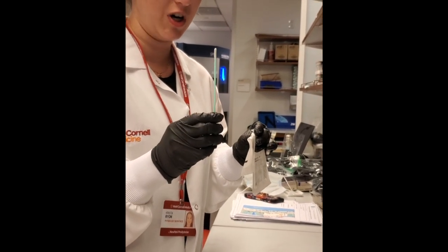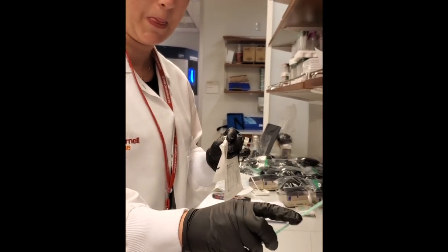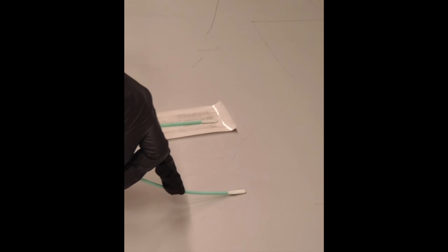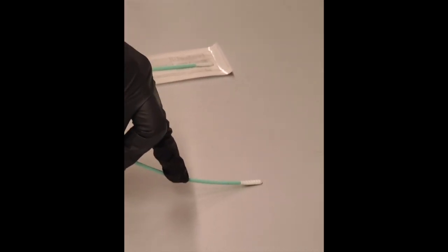Once you have a surface to swab, look at your surface, make sure you have a good area, and apply downward pressure at a 45 degree angle.